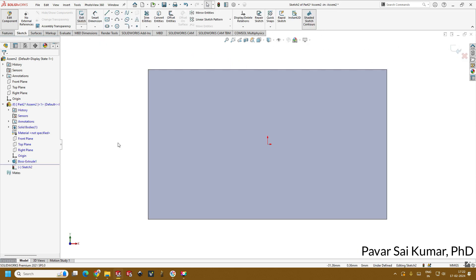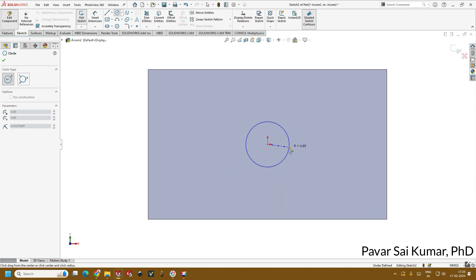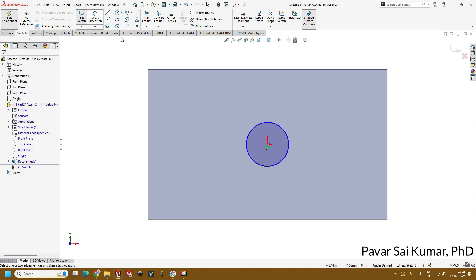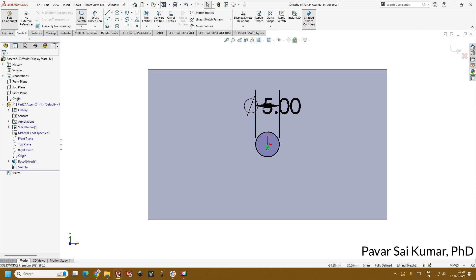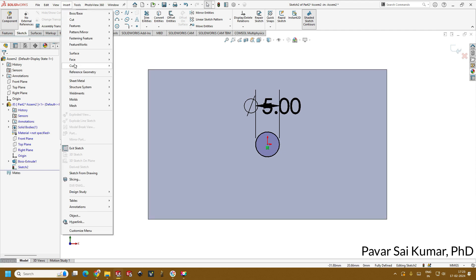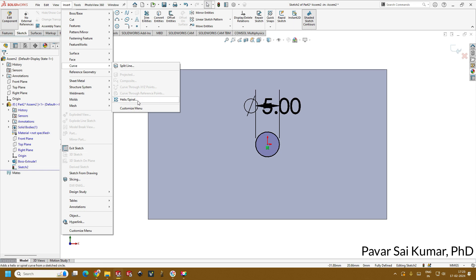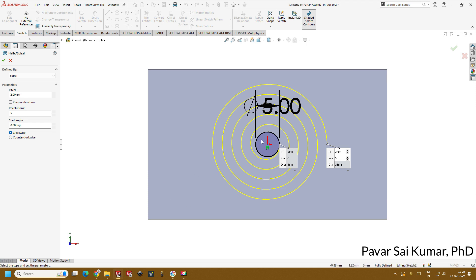Select the top face and click sketch edit. The important point here is you have to create a circle, and in the circle we will do an interesting spiral channel. There are very few — actually no — videos on making a spiral channel microfluidic chip, so that is the challenge I am tackling here. Create a circle initially; we will keep the circle dimension at 5 mm. Then go to Insert, then Curves, and select the Helix option. By default it selects the circle, and you can control the pitch — for example 1 mm or 5 mm.